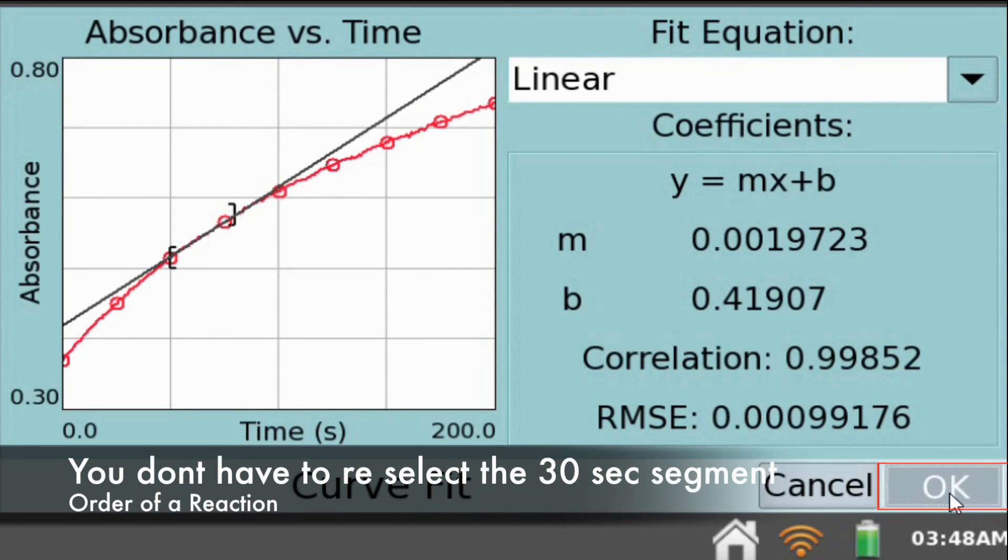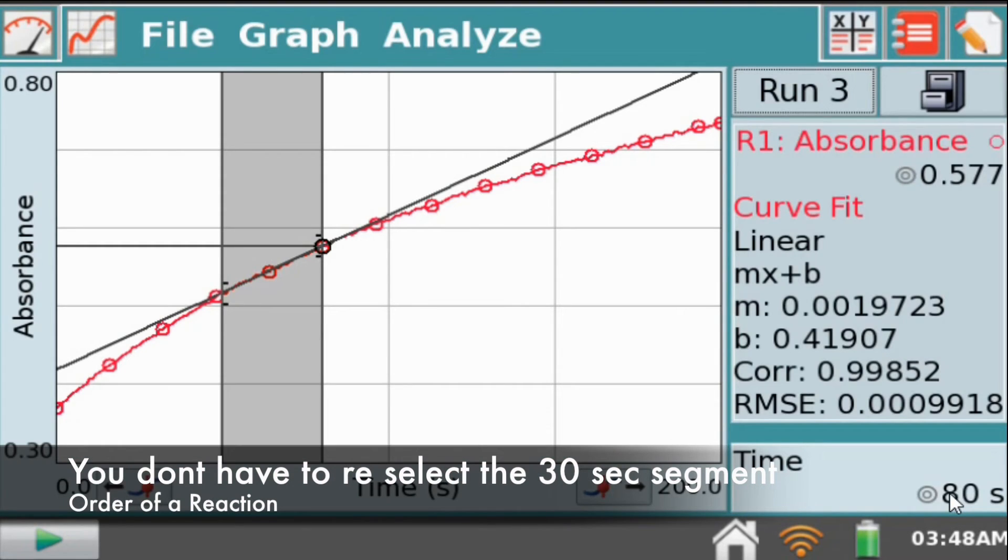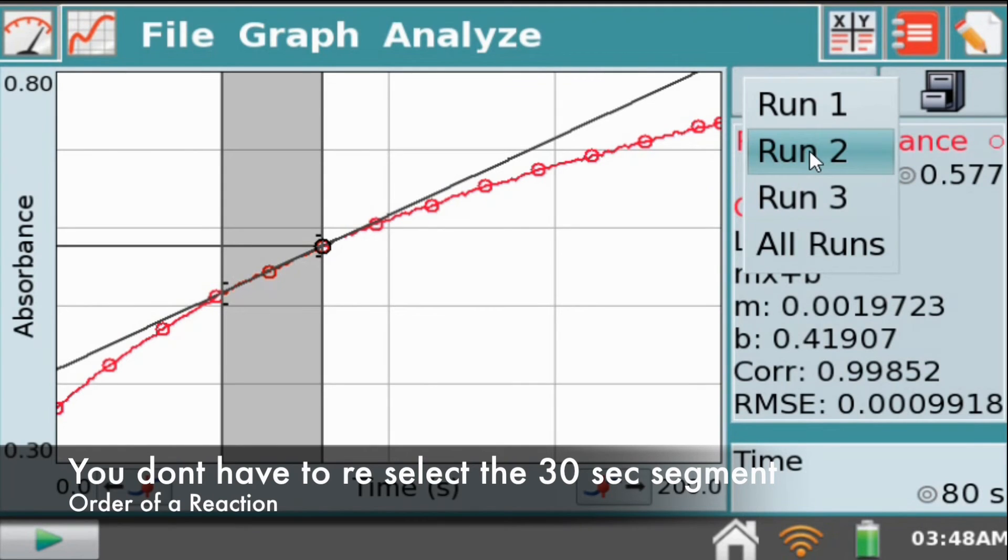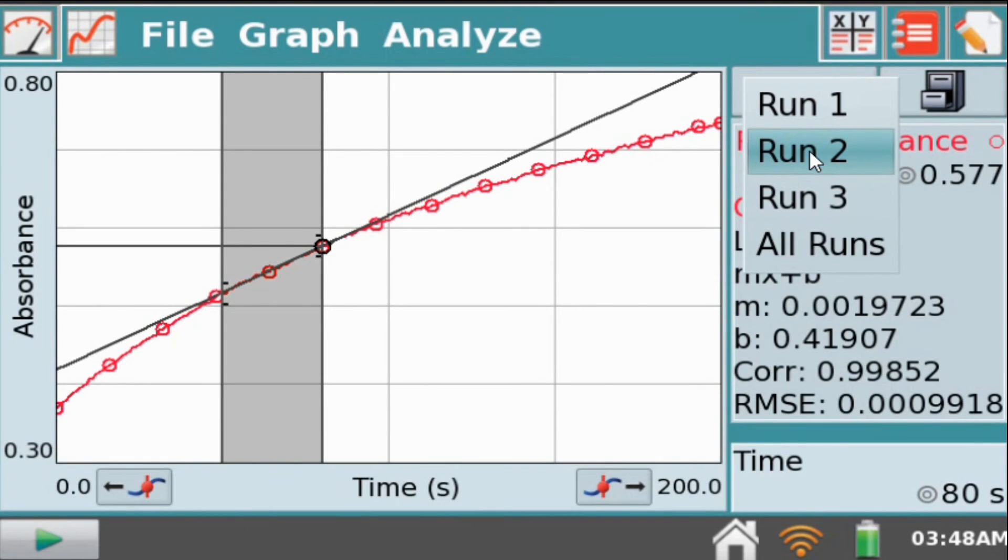Now select OK. Next, select run 2 and repeat the steps. Do the same for run 1.